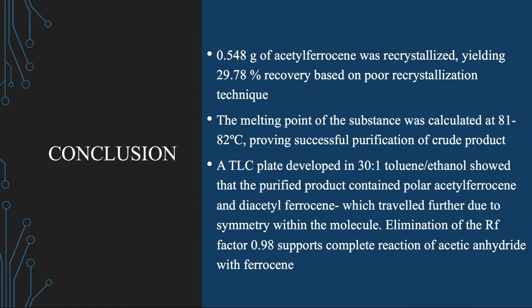So to sum up, we only had a 29.78% recovery of the pure acetylferrocene because of poor recrystallization techniques, which was 0.548 grams.